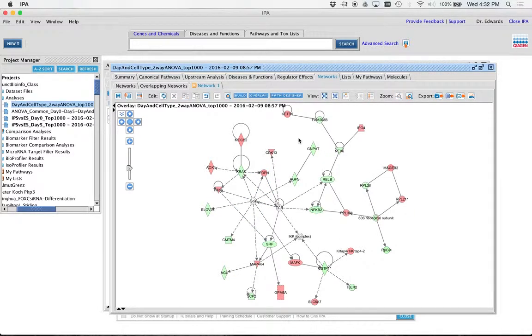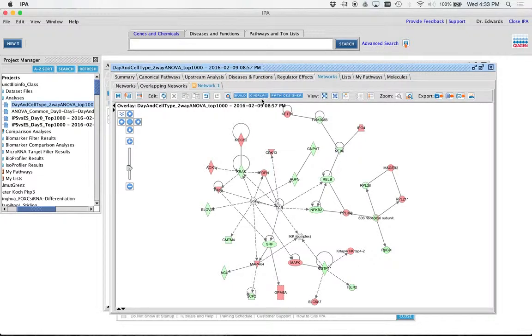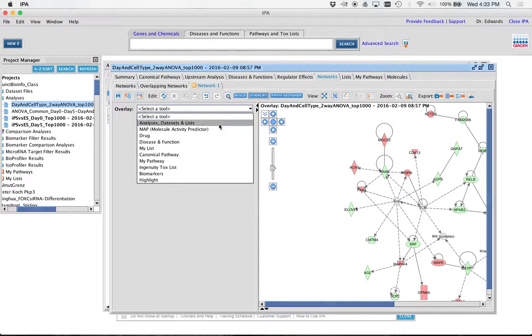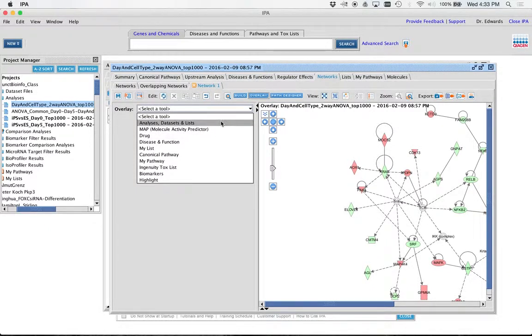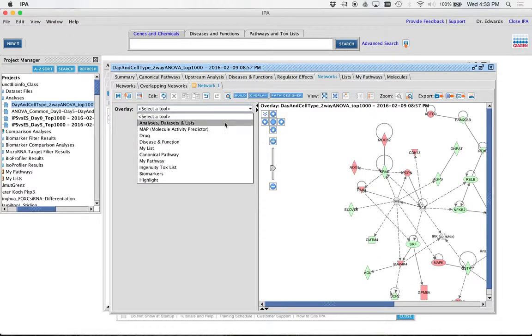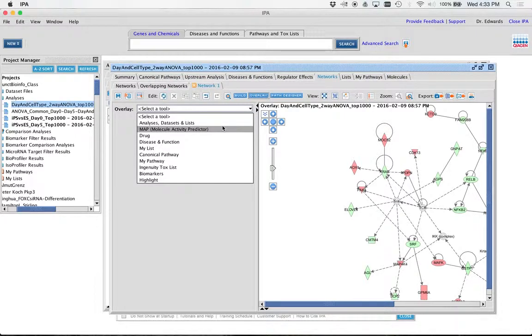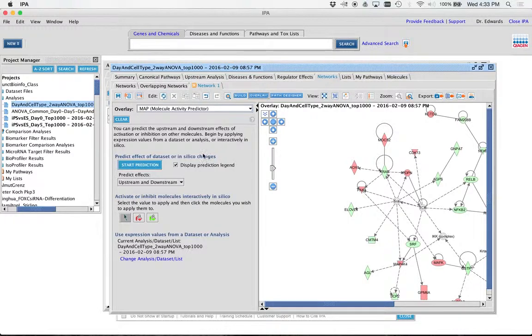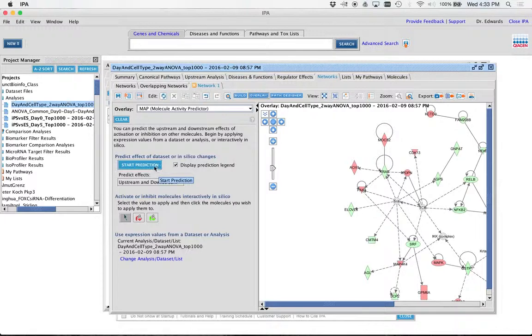Here's what we can do to this network now. Let's go to overlay. If I hit the overlay, that's the middle one, go down to molecular activity predictor or MAP for short. What this is going to do is color the line based on the relationships it knows in the literature. Let's start prediction.